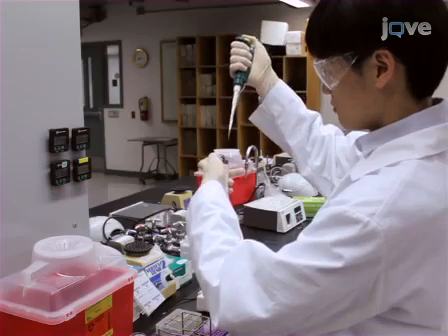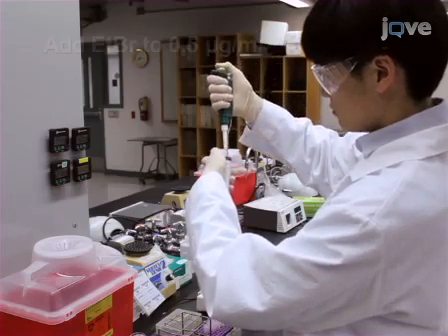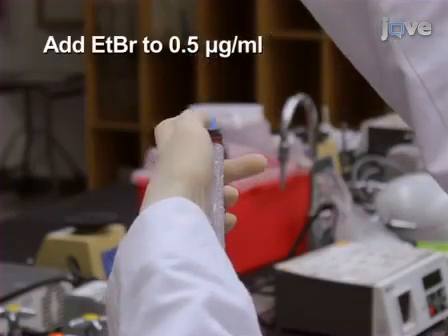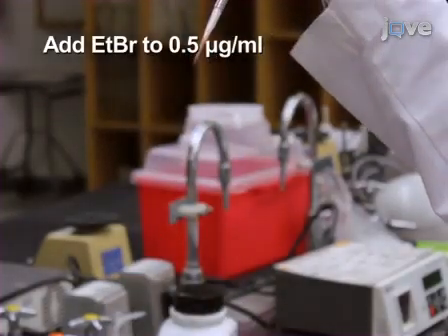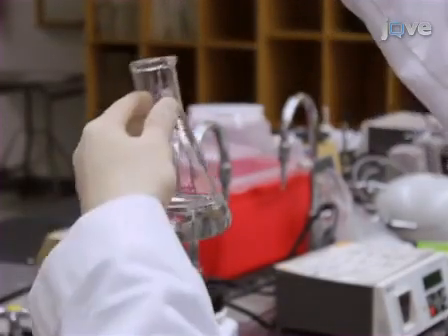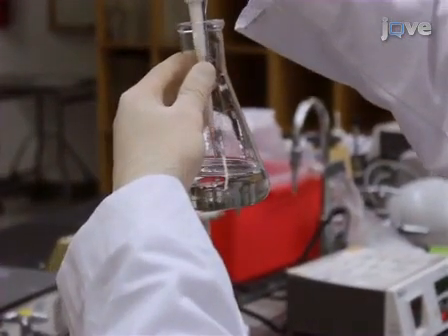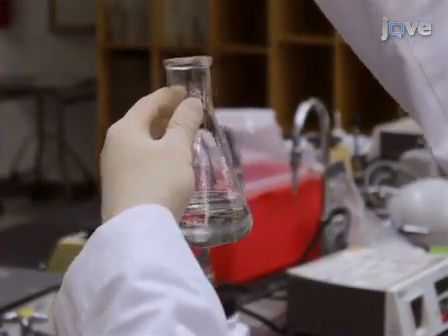Next, add ethidium bromide to a concentration of 0.5 micrograms per milliliter. It is important to note that ethidium bromide is a carcinogen, so gloves should always be worn when handling gels containing ethidium bromide.